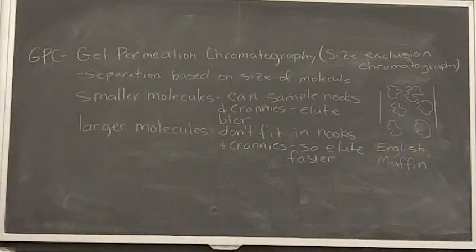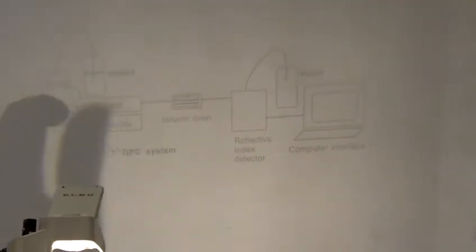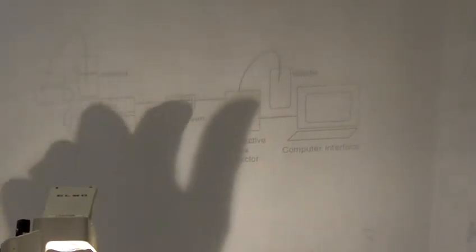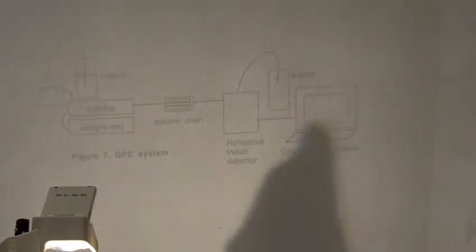And so, here's a little bit in your lab manual. It's kind of a schematic of what a basic gel permeation chromatography instrument looks like. So we've got solvent. In this case, we're using THF. It runs through a pump. And then we've got our samples that are all going to be lined up here. The samples you prepare this week. And then we've got an injector that will inject that sample into the column. And then it'll pass through the column, and this refractive index detector will detect what comes off that column. And then we use a computer basically to put all the data together, okay?